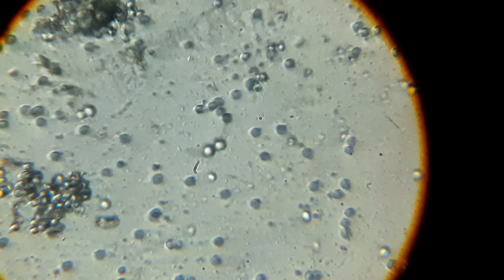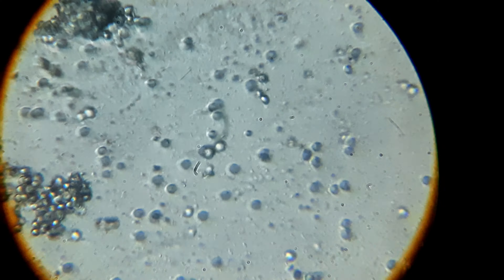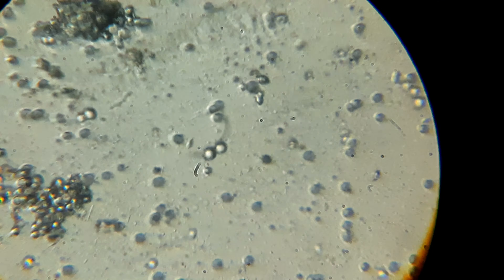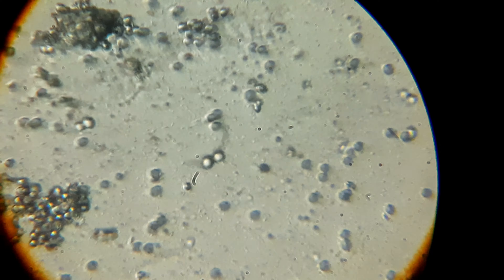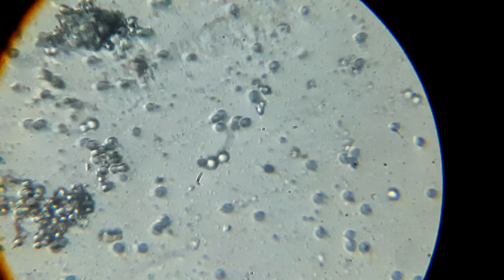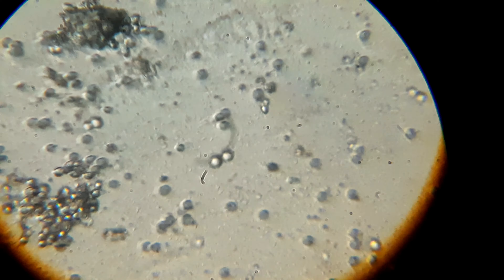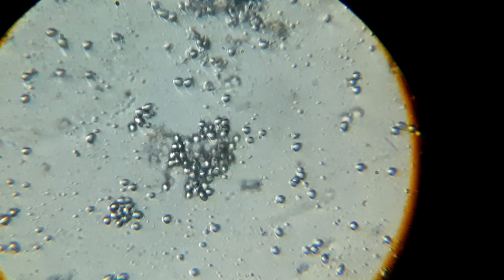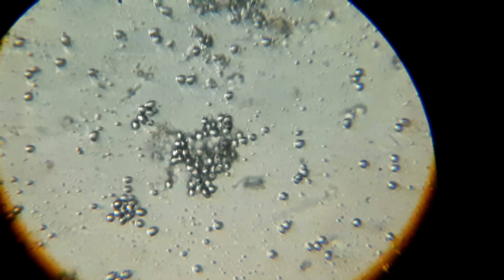The colors are changing because these are microscopic particles so the light changes quite a bit depending on the different lenses used. You must also be able to view some big clumps of spores which get coagulated — you just have to get them split apart. This is actually a little demonstration video for you guys.